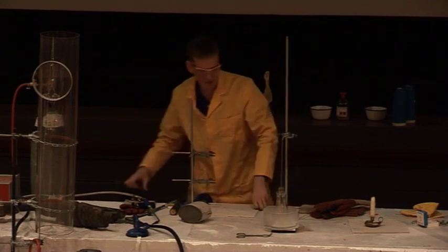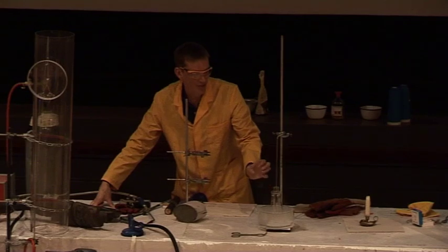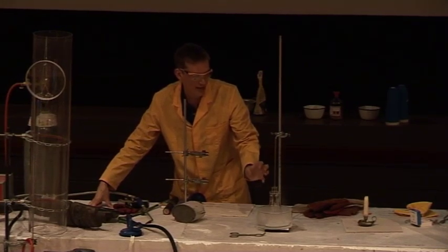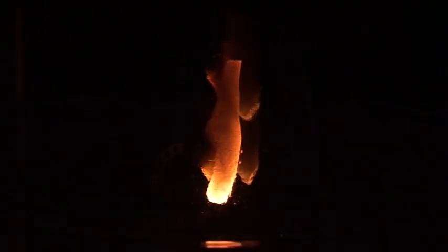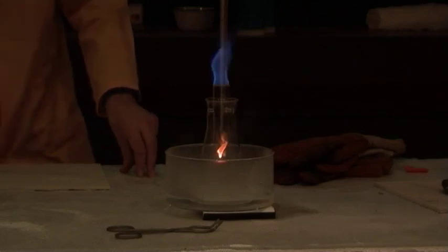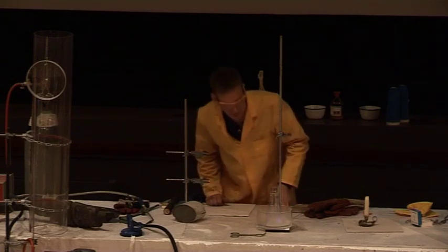As this reaction takes place, the catalyst will begin to glow. This is the methanol and oxygen coming into contact with the metal and beginning to react. This heats up the catalyst and it should glow red hot — and there we are, it's beginning to glow. Any second now it will probably light the methanol vapor — there we are. I'll blow out the flame.